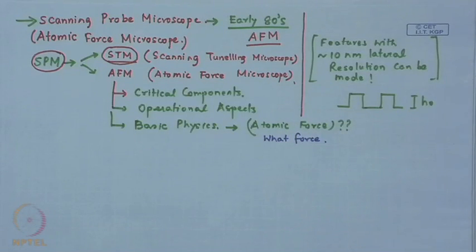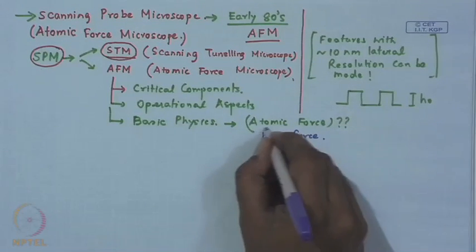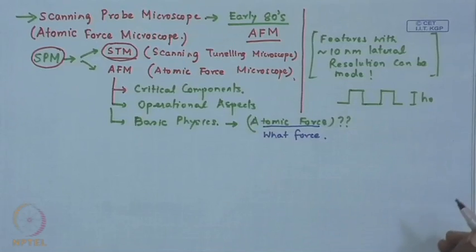and it is actually a nice bridge between the two parts of the course, that is the patterning part and the instability part, because the forces we introduce here are significantly responsible for the instability. In the first or the second lecture of the course, we talked about instability, spontaneous instability. So, those instabilities, as we will see, are caused by the same forces which are used to generate an image in an atomic force microscope.